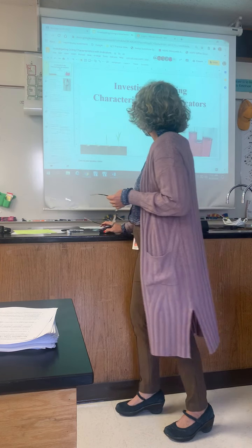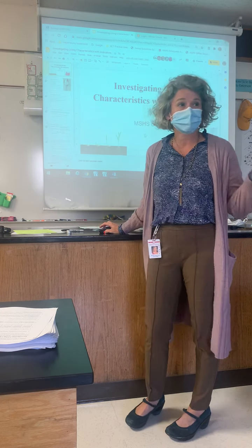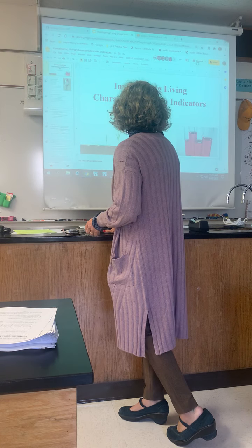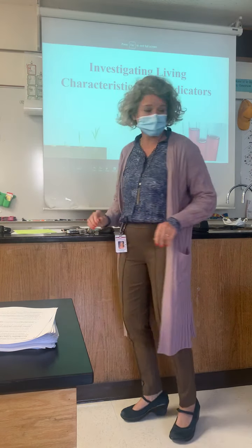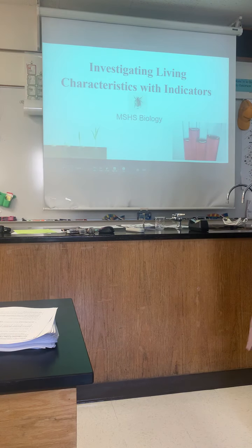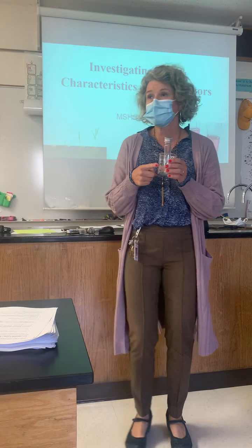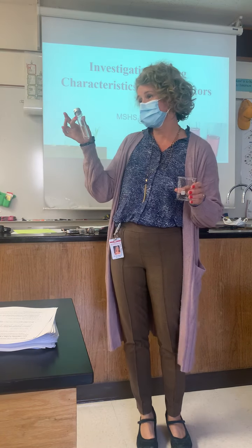Activity called investigating living characteristics with indicators. So let's make sure that you guys understand what all of this means. Let me first explain the experimental setup. The experiment, which you can see is on the cart over here, each student will get a beaker, a test tube.